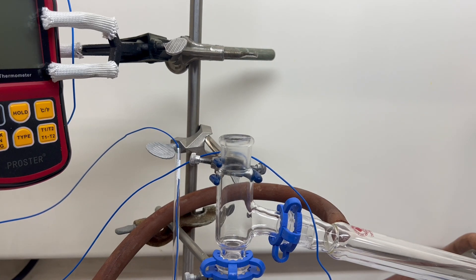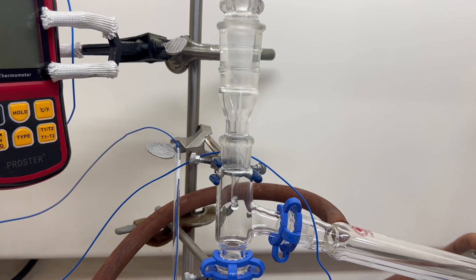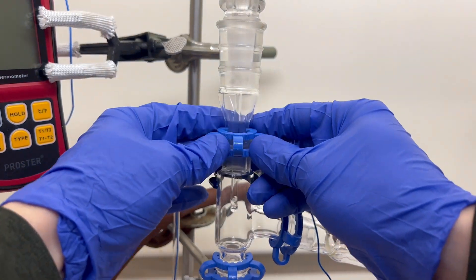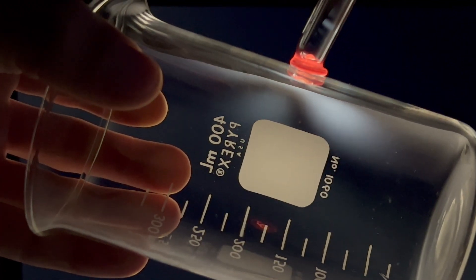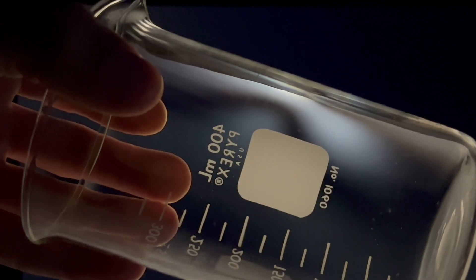Borosilicate glass makes up almost all the glassware in the lab. The boro suffix is thanks to the inclusion of boron trioxide in the glass. Adding the boron decreases the glass's thermal expansion, making it more shock resistant than ordinary soda lime glass. This shock resistant property makes it useful for equipment under constant thermal gradient. Now with that tangent out of the way, it's boron time.